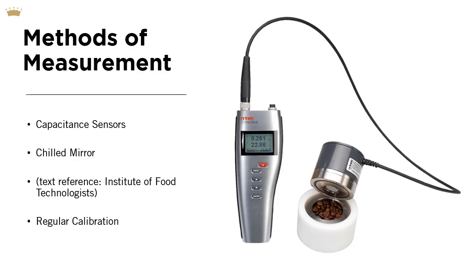This is a longer and more complicated process, and the devices that are used to measure it tend to be very, very expensive. And so it's not very common to see this in smaller laboratory settings. The Rotronic device you see here runs a couple of $1,000s, as does the entry-level one from Decagon. And that's, generally speaking, sort of where these products begin in terms of price point.